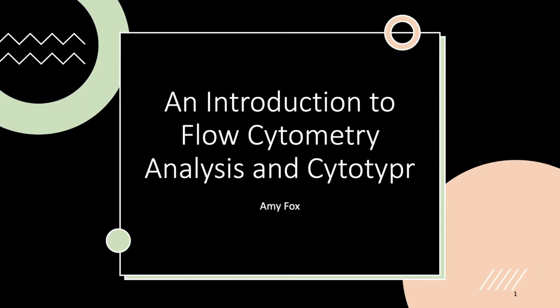In order to study the immune response, you have to have a method for identifying and analyzing potential immune cells. I realized that conventional methods to analyze flow cytometry data are cumbersome and time-consuming, so I decided to develop and test a data analysis pipeline that aids in the identification of immune cell populations.